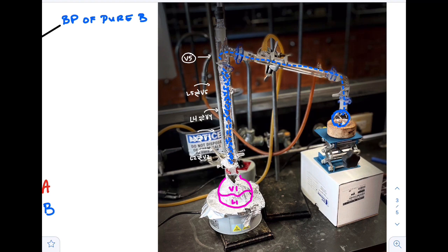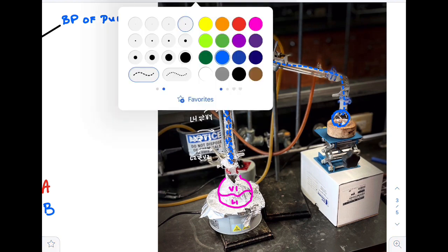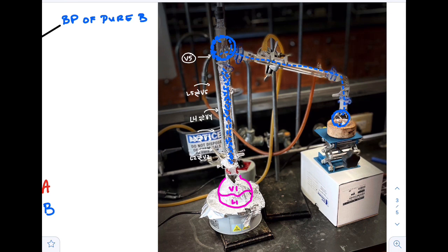And not only that, but I can actually still collect different fractions. So once I collect at some temperature that I've recorded here and it starts to go up, then I can take this flask out, exchange it with another one, which you'll see that I do in the lab. So that's the best way to go about it, is kind of switch out your flasks, and then you can test the composition of them and see if you want to combine them, or maybe you don't want to combine them, who knows.